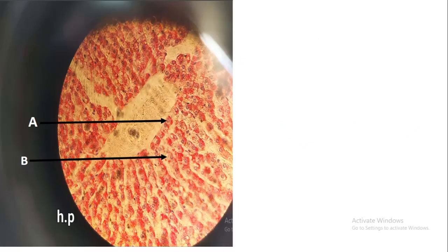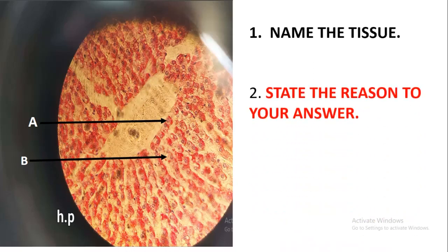Okay, let's quickly look at that. The first question is, name the tissue. What tissue is this, guys? This is the liver. Remember what I said? I said you'll be asked to identify the tissue. After you identify the tissue, they'll tell you to state the reason for your answer. Why is it the liver in this case?